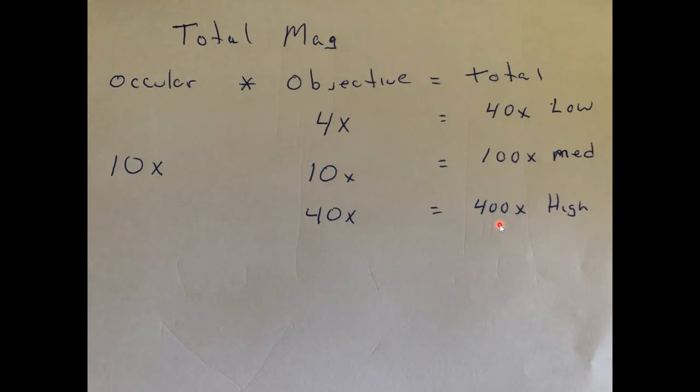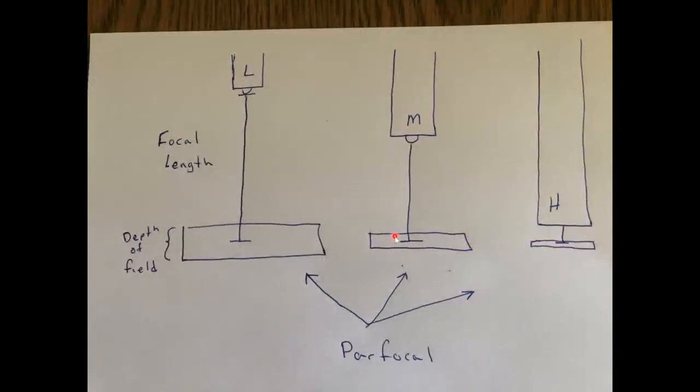Now, some microscopes in the A&P1 lab, they're not supposed to be in there. In the A&P2 lab, there are, and certainly in the microbiology lab, there would be another lens called the oil lens, which would magnify 100 times. So 100 times 10. I know you can do that. If you had 10 $100 bills, how much money would you have? See how fast you figured that out? It would be 1,000 power, but it's called the oil lens, and I'll explain that from this picture.